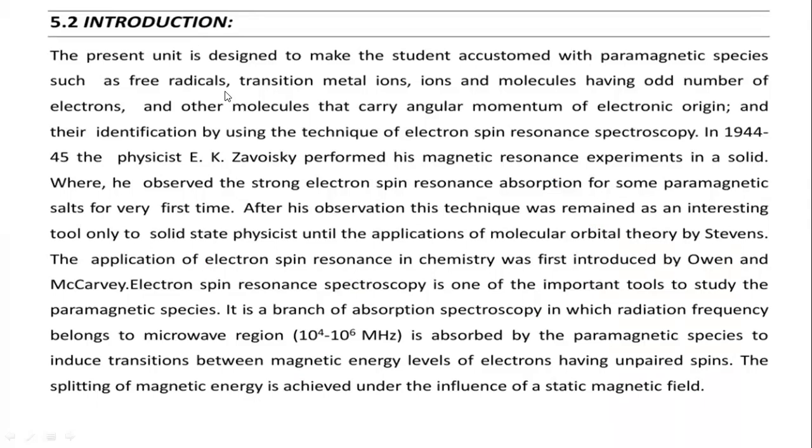So, other molecules that carry angular momentum of electronic origin are also identified using this technique of electron spin resonance spectroscopy.